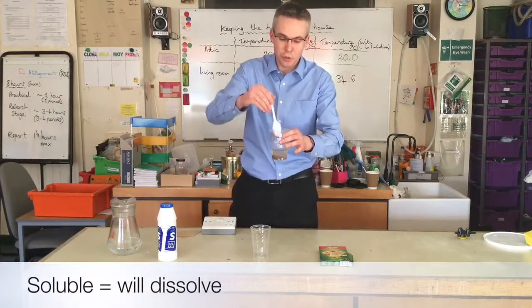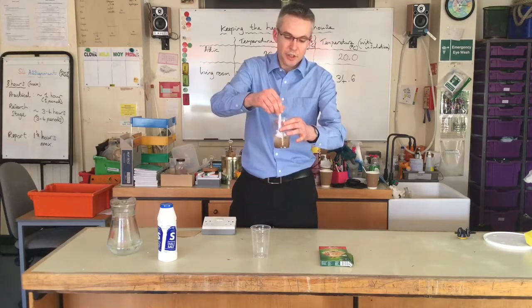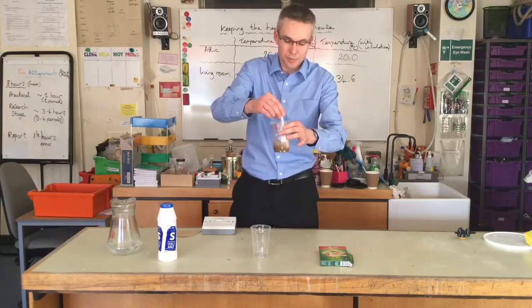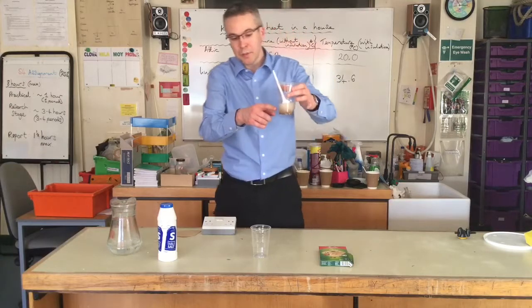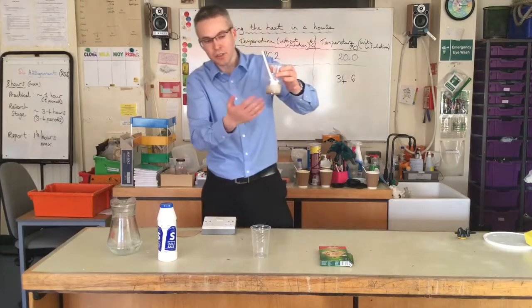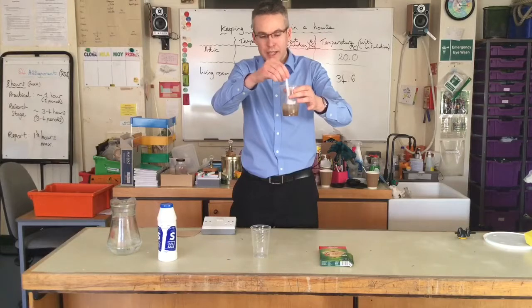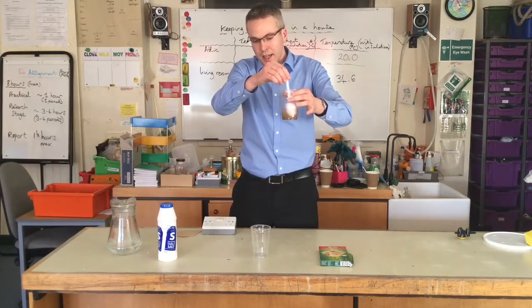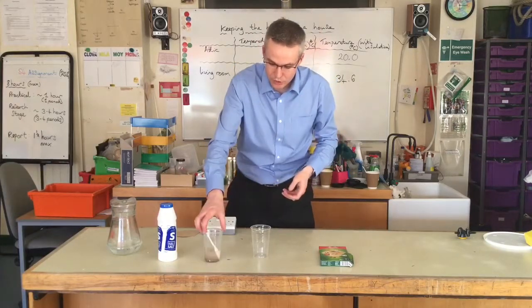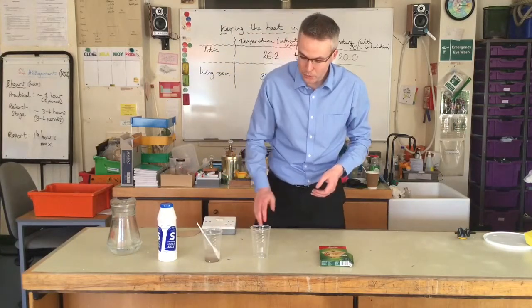And just taking a plastic spoon or a plastic fork, simply by mixing the two together, after approximately 30 seconds the salt should have dissolved into the water, and the pupils shouldn't be able to see any more white solid floating around. If they can, it's worth just getting them to stir it for a little bit longer, but of course the sand will always remain there. Now, you can leave that to settle and just sit for a minute, just to make sure all the salt has dissolved and the sand will sink to the bottom.